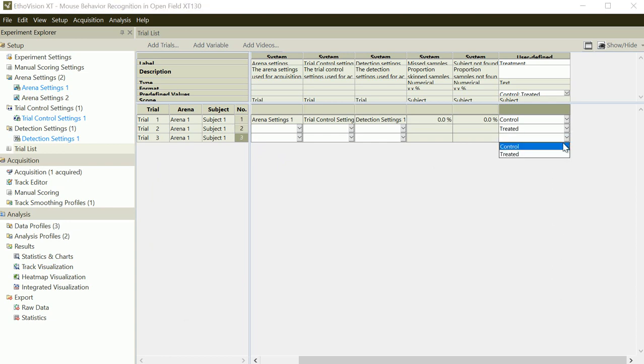But you can set those labels onto each individual animal quite flexibly, and these labeling will be gathered at the point of final data analysis. Okay, let's go to the next one.